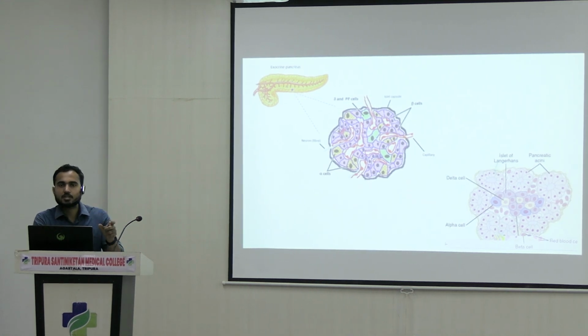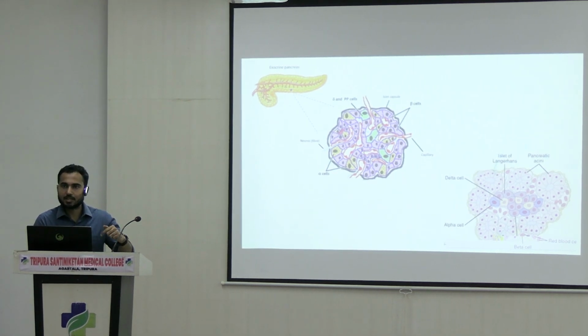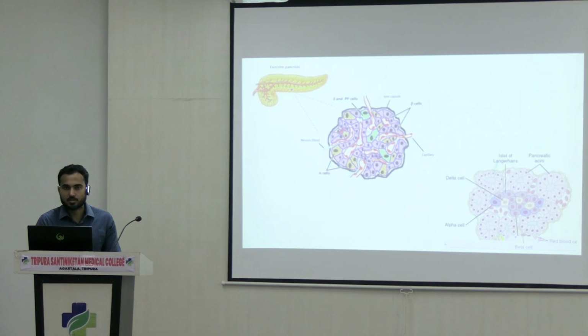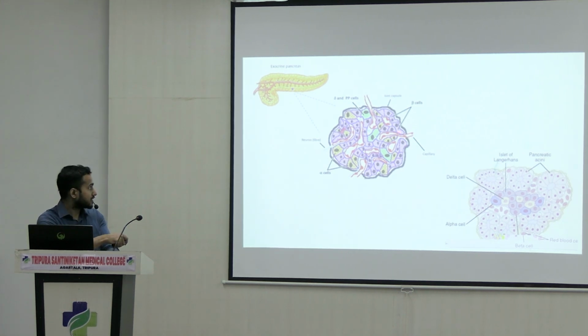Why am I focusing on this? Because in the same tissue, there are some areas where you get ducts and some areas where you get capillaries. So try to understand the difference. The acini will be associated with the duct system. But in the islets, there is a cluster of pale-staining cells, arranged in cords, attached to each other with the help of desmosomes and gap junctions. Here, instead of ducts, you are getting capillaries.